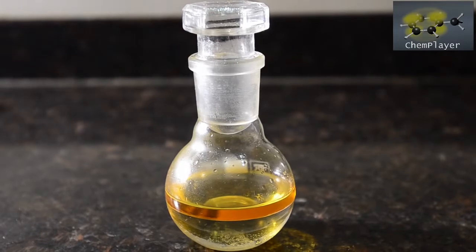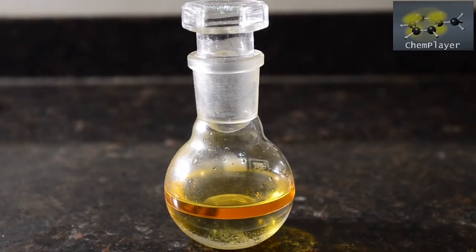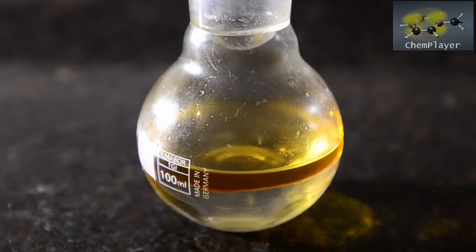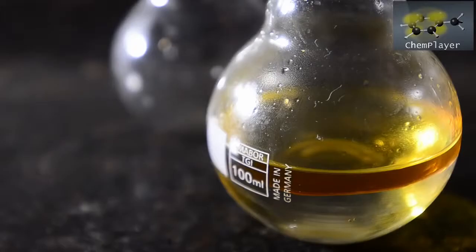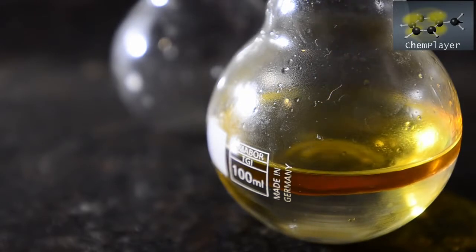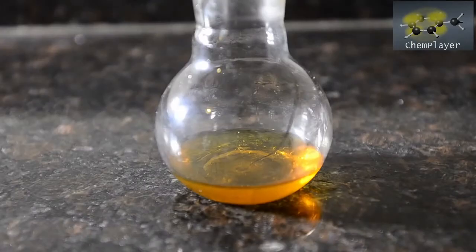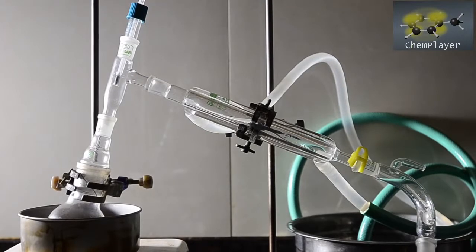Here's our crude distillate with a top yellow colored organic layer containing our acetophenone. But it also contains a lot of other things as well, so we're going to need to separate them. First of all, we separate the organic layer into a different flask, and we do this using the pipette as there's not much of it and this is pretty easy. Okay, here's our organic layer. Now to separate the different components of this we're going to set up for distillation.